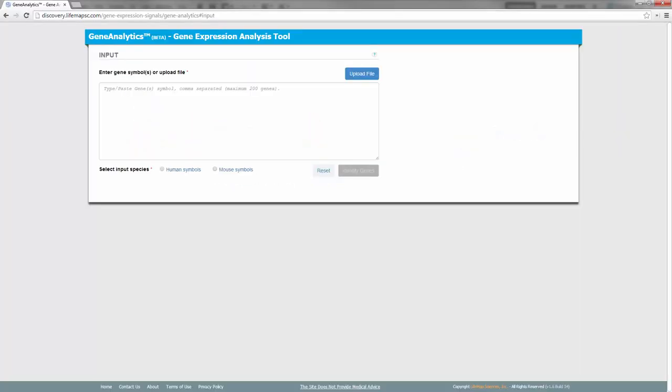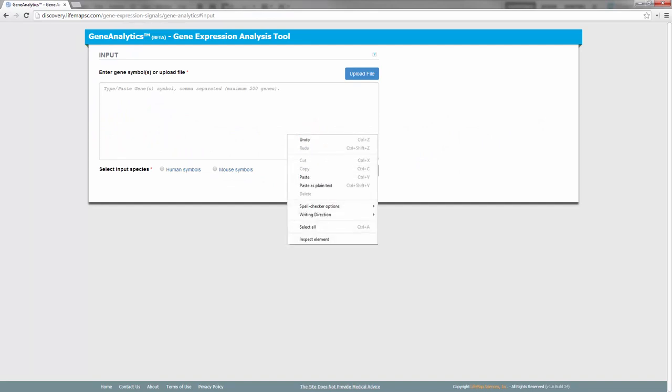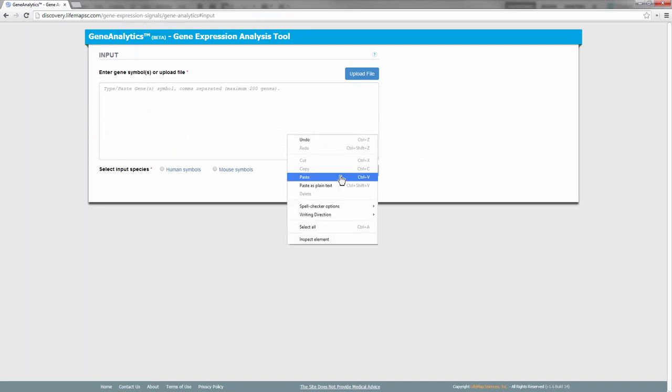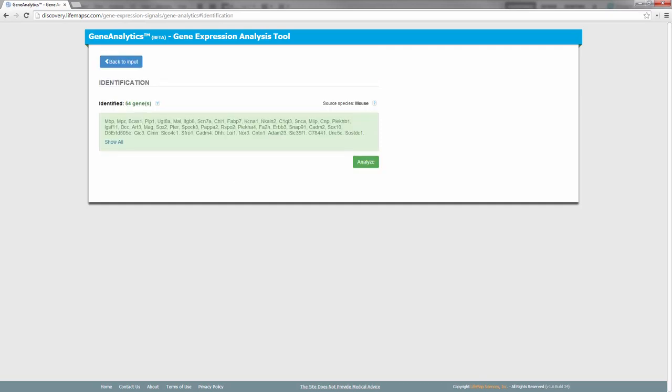Let's start by copying the list of genes into Gene Analytics. We then select the input species, which is Mouse in this case. We then click on Identify genes. This validates the genes in our list.